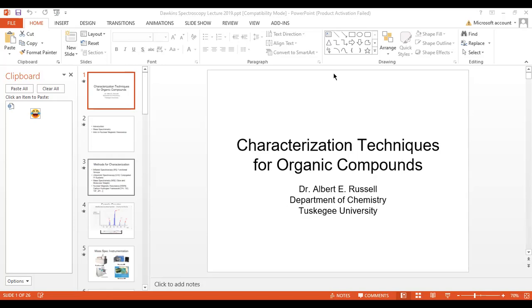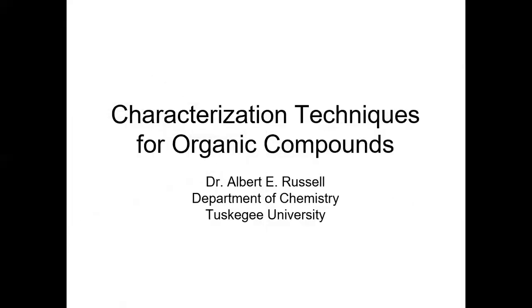All right. So let's jump in, and come on, PowerPoint. So everything that we're going to be talking about for the next several days is going to be centered around characterizing compounds. And again, if you've taken organic 1 lab, you already have some experience with this. We've done multiple characterization methods. We studied melting points. We studied pH. When we made aspirin, the purple color test with iron chloride, we did NMR and resolved the different peaks in the NMR and figured out which protons they belong to. We also did infrared, so you can see the different functional groups that were present.